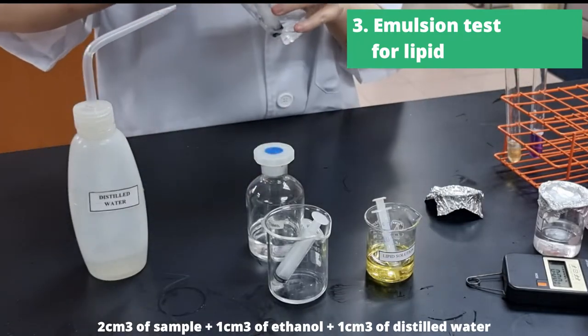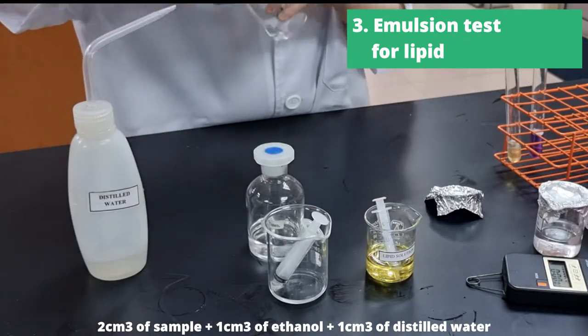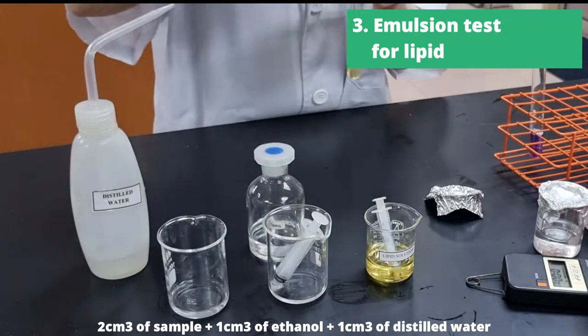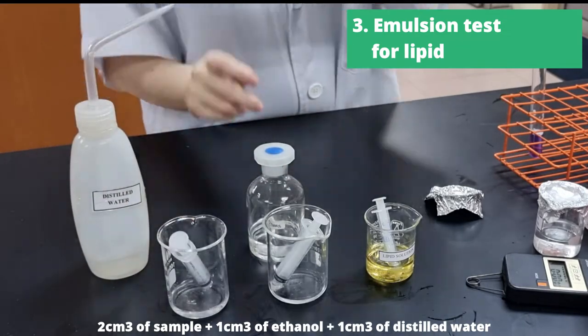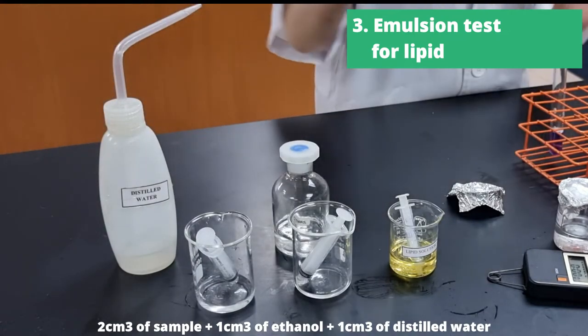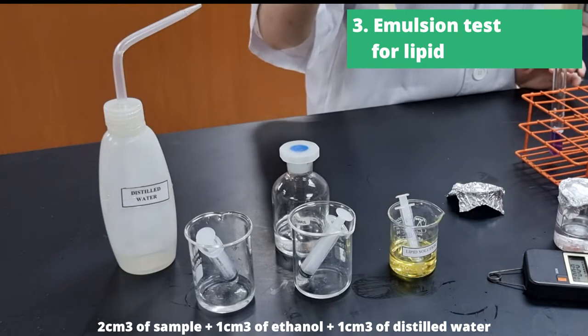Initially, those layers will not mix, but after you put a rubber stopper on the test tube and give it a little swirl — vigorously actually — you'll end up with a wonderful white, cloudy emulsion.